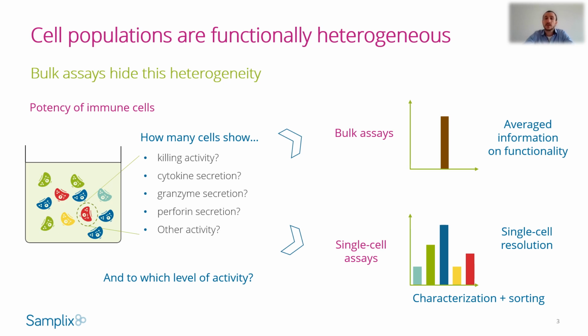This means that you can characterize in depth the functional characteristics of the different cells in the populations, and you're also able to sort out the ones with the desired functionality.